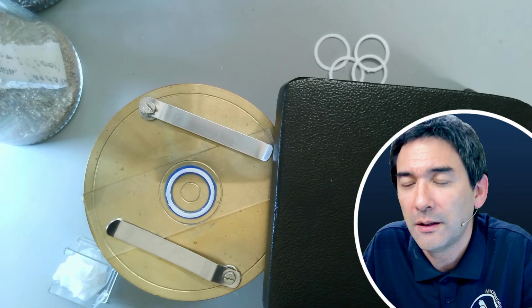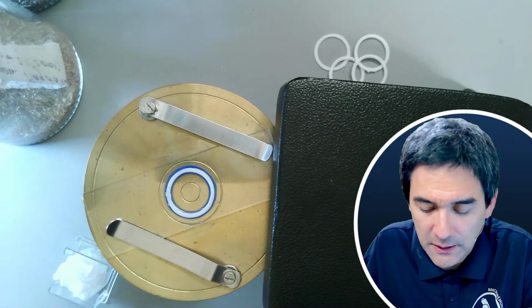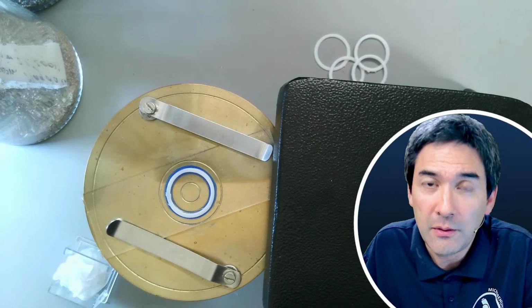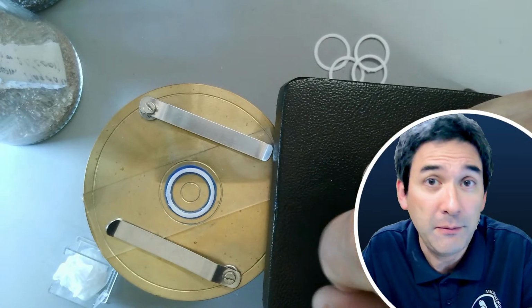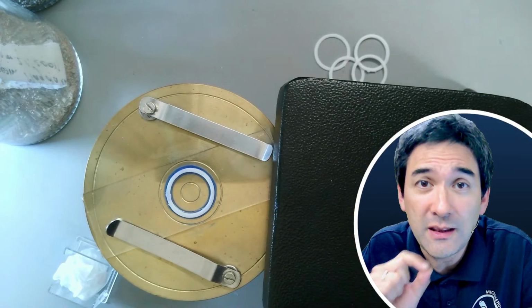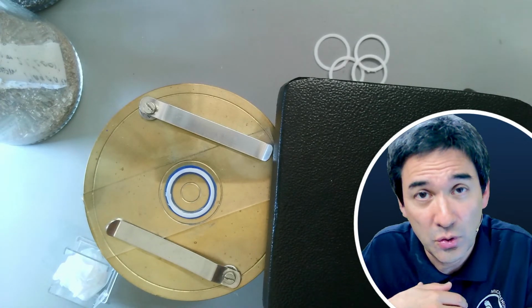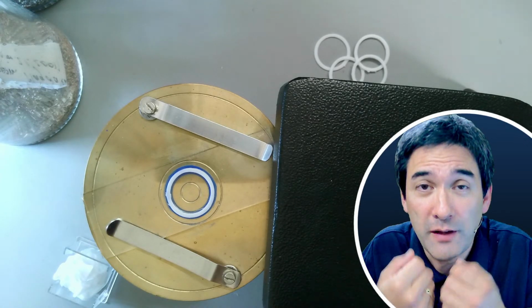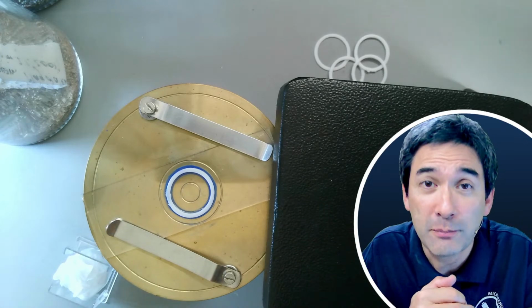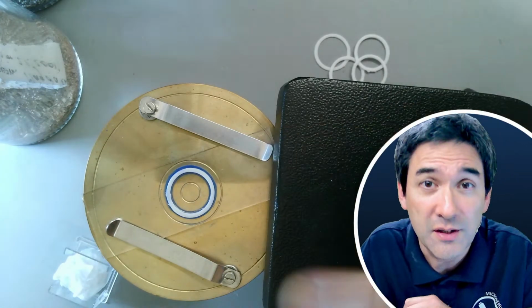Would the thickness of the ring allow a short working distance objective to focus? That's a good one. Be careful. The 4 times objective might be fine, but because it's pretty thick, high magnification is not going to work, and it is not meant to be used with high magnification. To get the resolution of a high magnification power, you also need a proper mounting medium with a proper refractive index, and we're just using air as a mounting medium.